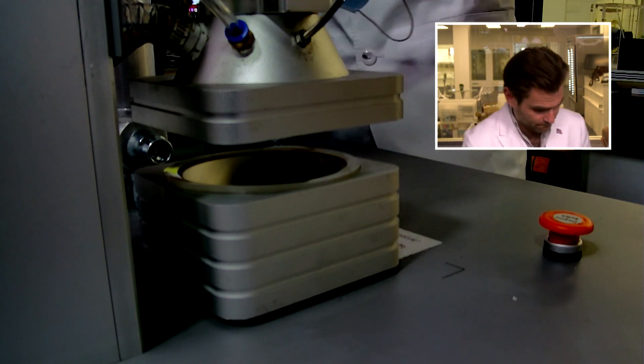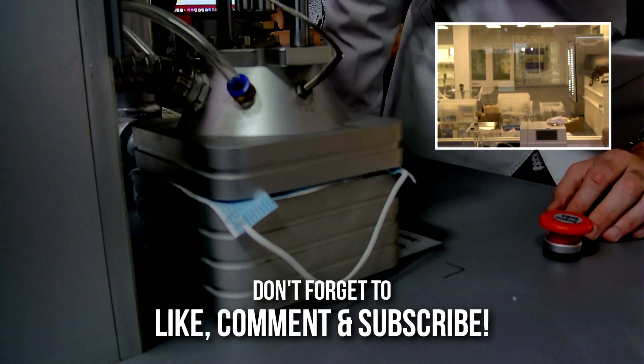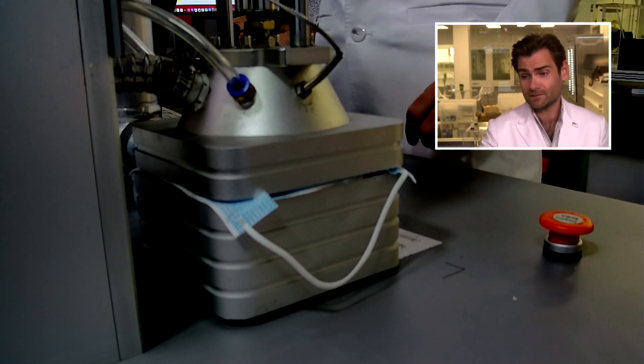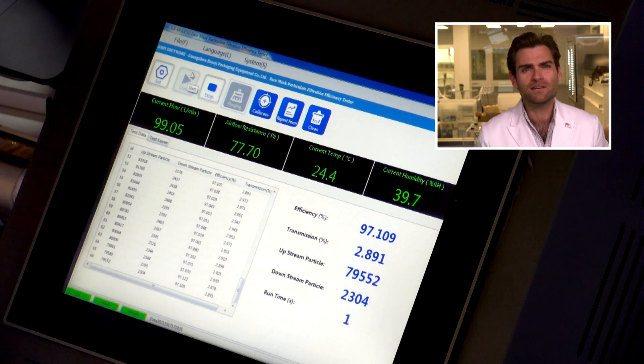Let's put it in the clamp and we'll talk about it. This is a PFE machine — particulate filtration efficiency machine. We're doing the American standard test for surgical masks here, ASTM 1, 2, and 3. Got to get 95% or better, otherwise it's not meeting those standards.